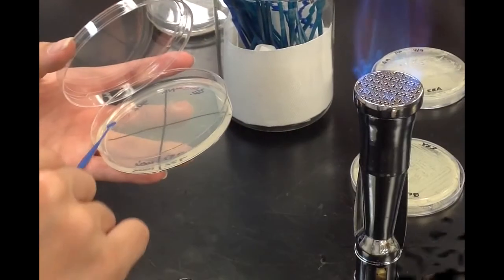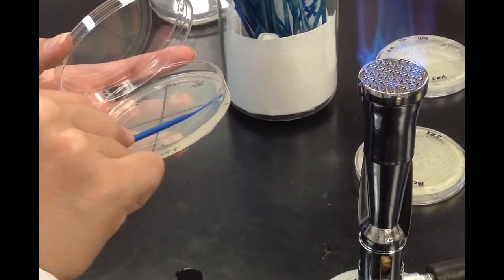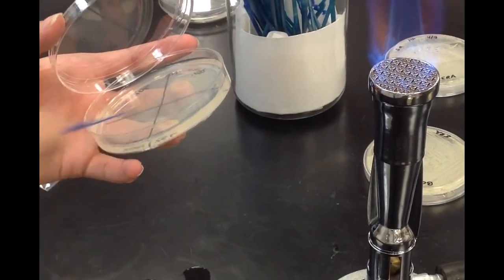24 plates of plain nutrient agar were gathered from the microbiology lab. Then, 12 of the plates were quadranted to be labeled 5, 10, 15, 20, while the other half were labeled 25, 50, 75, 100%. Later, 6 plates of all of those concentrations were streaked with the 4 different types of bacteria we inoculated.